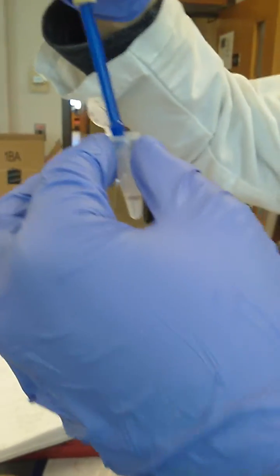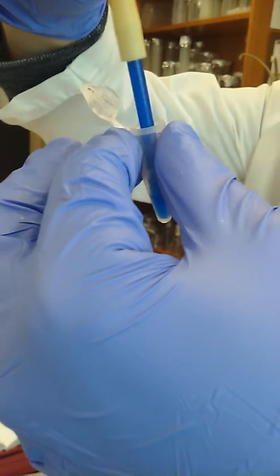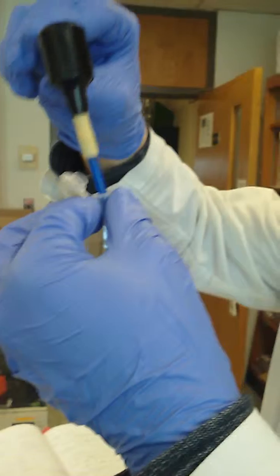Here we go. Frozen retina being homogenized in lysis buffer for RNA. The only real trick is to keep the pestle moving up and down, because sometimes the tissue gets trapped in the bottom of the tube and just homogenize.